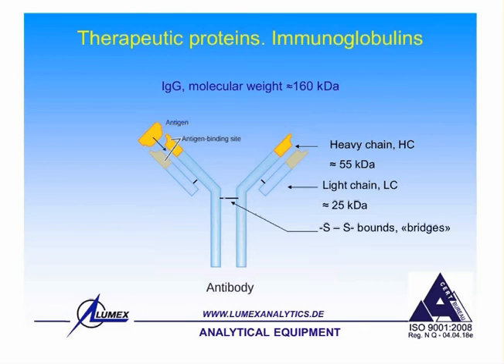But if you want to shorten the total analysis time, you might understand that the analysis generally consists of several stages. You rinse the capillary with one solution, then another solution, then a third solution, then you inject your sample, then you apply the high voltage in order to provide the run, and finally you get your results.